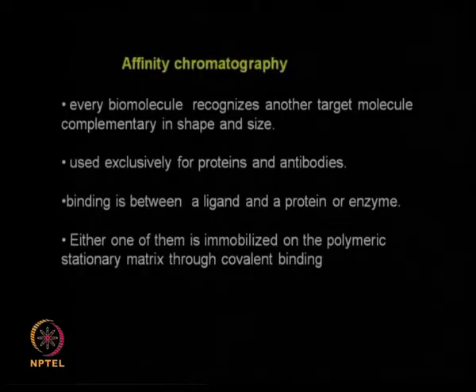We talked about ion exchange chromatography, gel permeation chromatography, and reverse phase or hydrophobic interaction chromatography, and recently I started talking about affinity chromatography. Affinity chromatography looks at the affinity between a ligand and a protein. That means a biomolecule recognizes another target molecule complementary in shape and size.